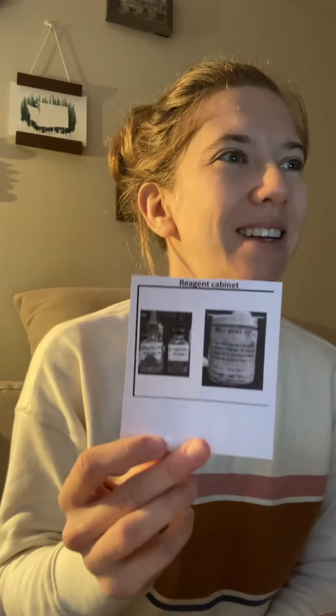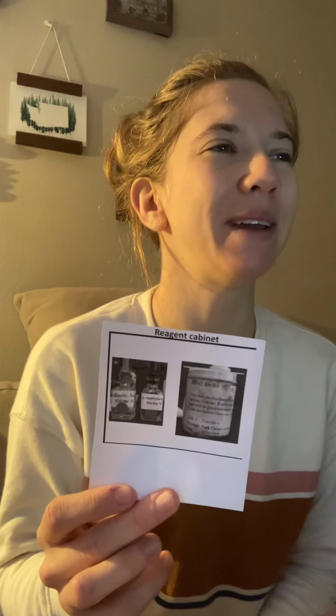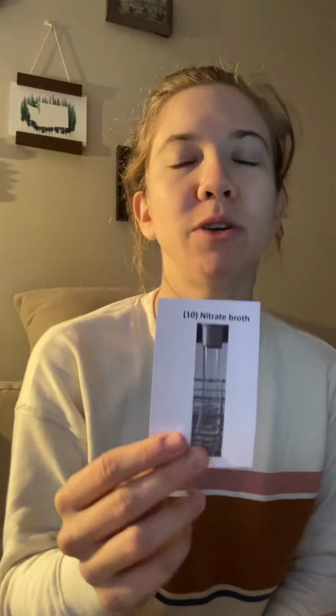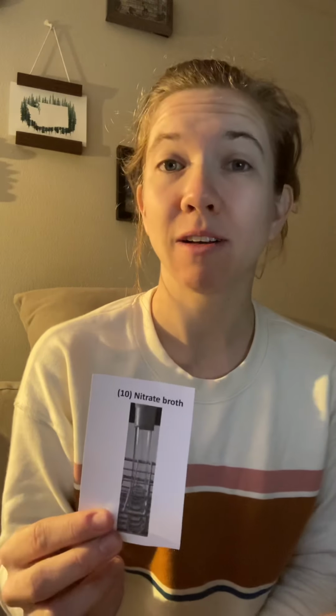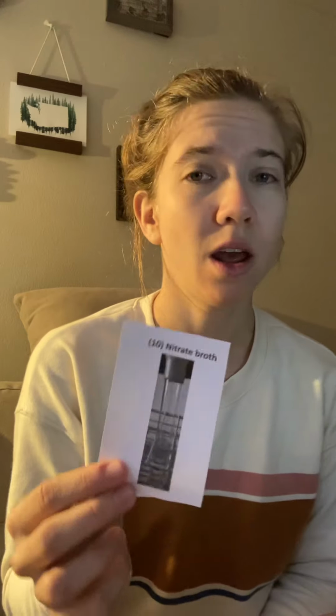A couple things we're going to need from our reagent cabinet: sulfanilic acid, or nitrate A, and alpha-naphthylamine, or nitrate B. We're going to use 20 drops of each of these in each of our tubes. And remember, every time you open a tube, you should be holding it in front of the micro incinerator to kill off any bacteria maybe hanging out in that lid or on your hands, just to keep things as pure as possible. After you have added your drops, you're going to mix each tube really well. Make sure that everything has had time to travel through the substance.